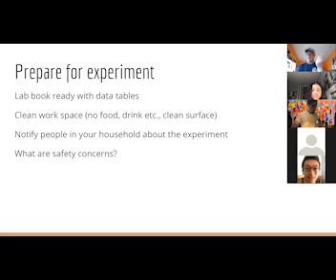Because contacts, basically, if you spill something in your eyes, and I think I probably mentioned it before, the chemicals will concentrate under the contact and actually prevent you from washing your eyes out. And so, yeah, it's extra bad having contacts in the lab. You definitely don't want to do that.